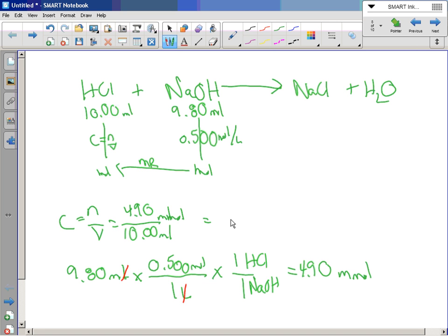What do I get? Oh, that's just moving the decimal over once, isn't it, by dividing by 10? So what's that? 0.490 moles per liter. And there is our unknown concentration. And that's cool because I made both of these solutions and I tried to make them both 0.5 and they're both close. I don't really know whether that's 0.5. That's what your job tomorrow is going to be. How close to 0.5 is our sodium hydroxide so we can know it very well, and then we'll use it on the vinegar the next day.